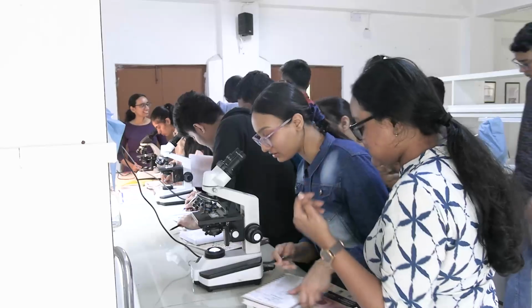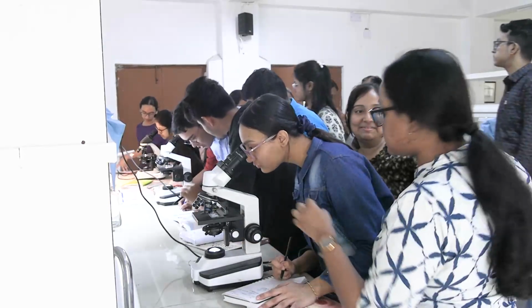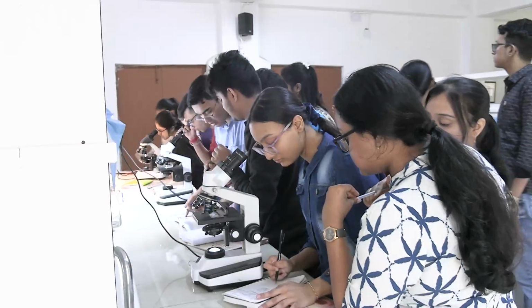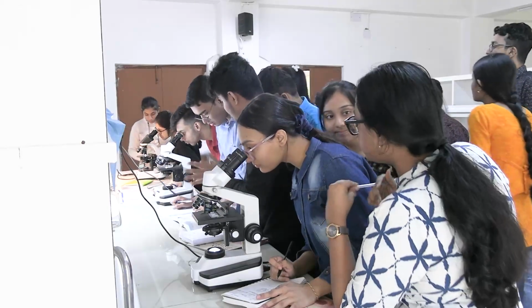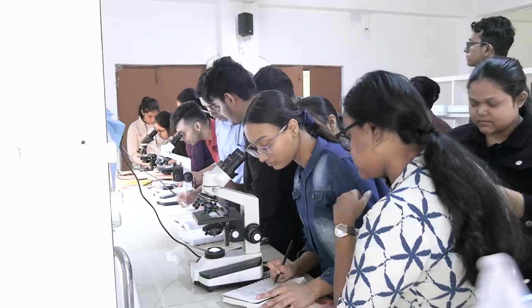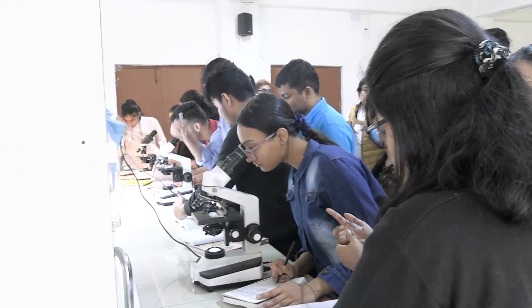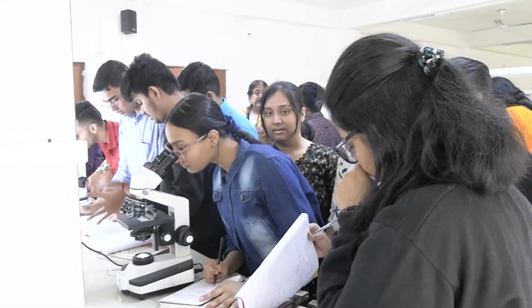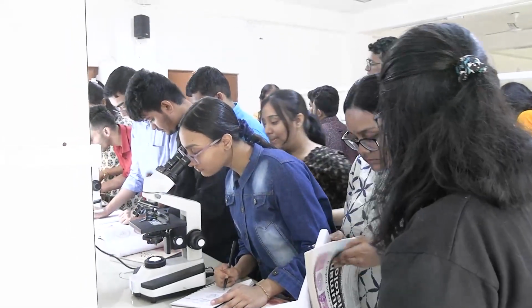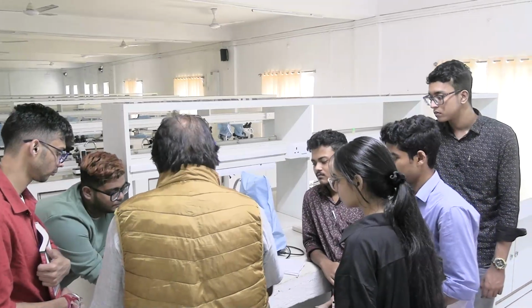You have to see it yourself. I'll tell you the basics. I will tell you where the things are. Like I told you, when I saw that slide first, I said, beautiful. ঠিক আছে? I exclaimed. But when I went to it, I told you that it is lightly stained. Go according to the book, draw.